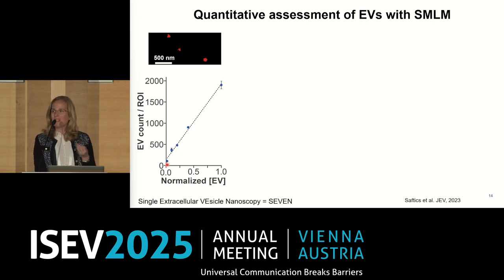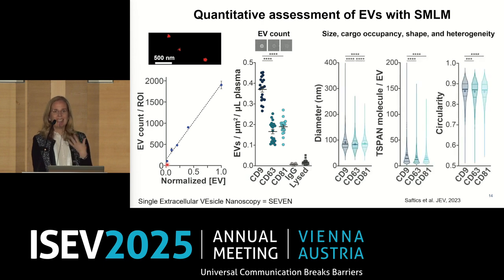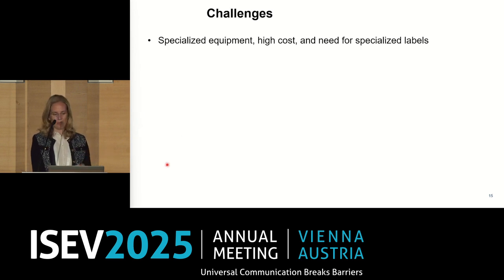But remember that when I am looking for those rare vesicles, things are a little more challenging. Then I can apply immunocapture and look at subpopulations. And you heard Clotilde this morning, sometimes we care what the population of molecules on the surface is. So if you can isolate them and say something about their size, their shape, their molecular content, we will have a wealth of information.